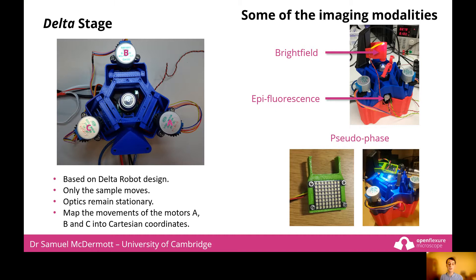The standard modality is bright field illumination, where we use a white LED to illuminate the sample. We also have epifluorescence illumination, which you can see poking out the base of the microscope — this uses a higher power star LED for illumination and glass filters. Pseudophase allows us to increase the contrast of objects; here we use a small 1 inch squared LED grid, which we can control using the Raspberry Pi, allowing us to change the angle of illumination rapidly to capture pseudophase images.